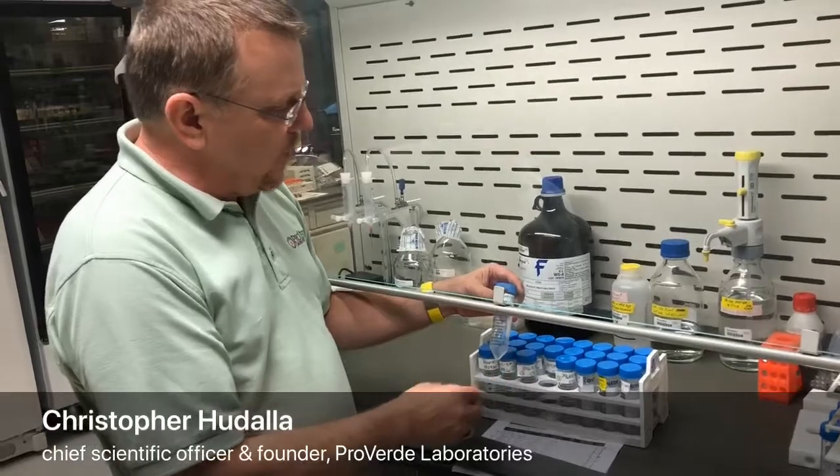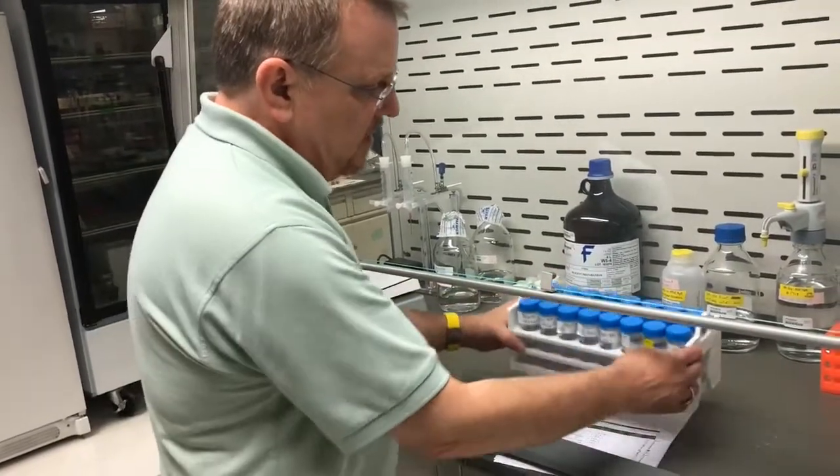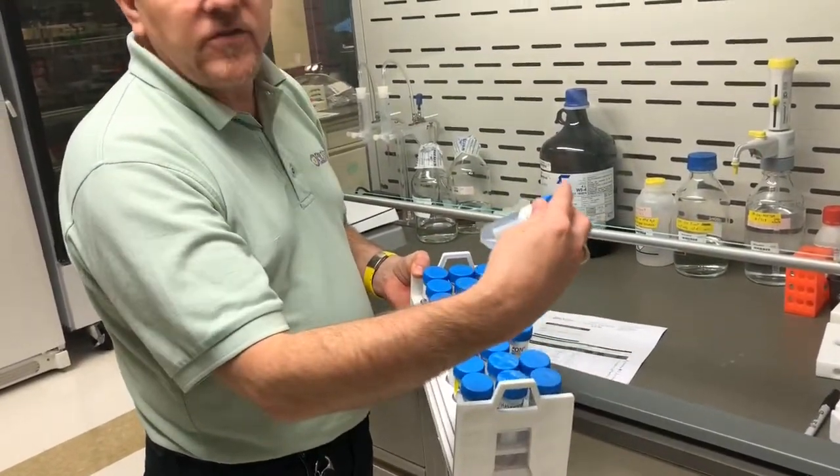They're in their chemical or atomic form, and then we'll use this to go into the instrument lab on the other side. So we'll just take this whole rack, and then these will be what are analyzed on the system.